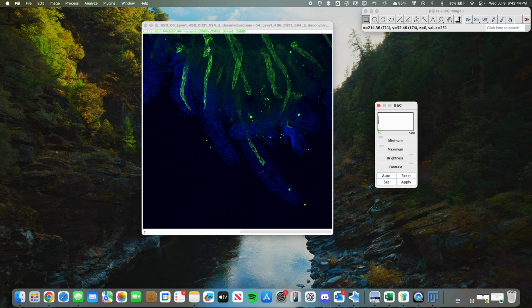So remember, this green is lacteal and extends from these lymphatic vessels. If we were to expand the image, and if there were more to the image above this, it would just be that same picture from last time where there's many vessels moving through and connecting through these lacteals. So we're going to start with this lacteal just to measure.